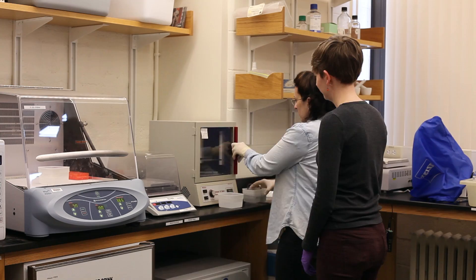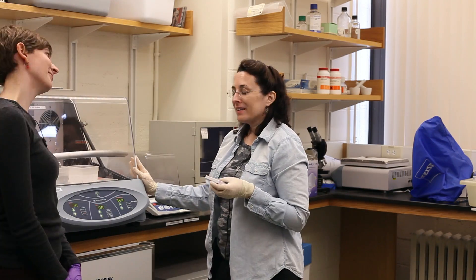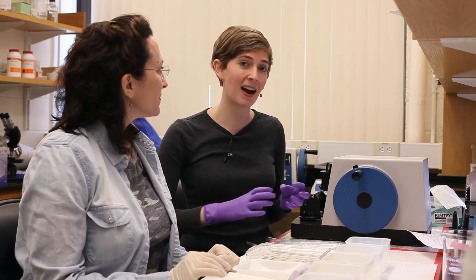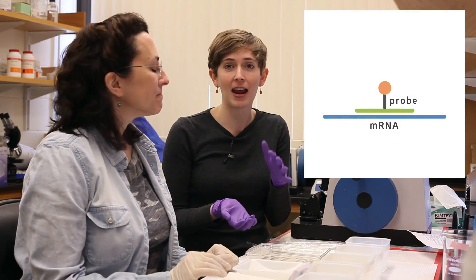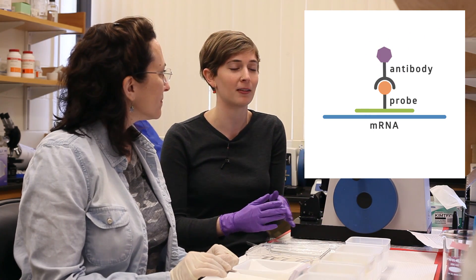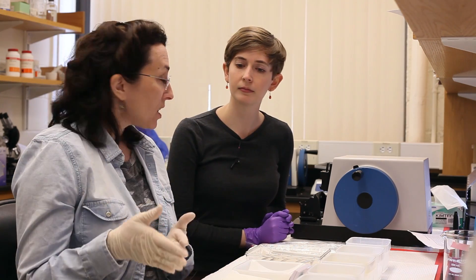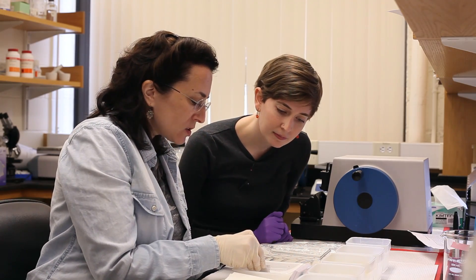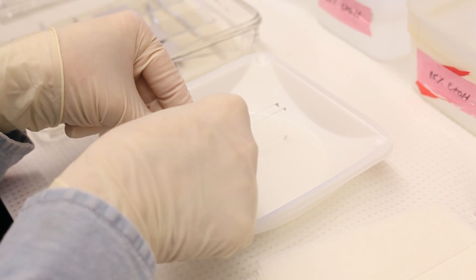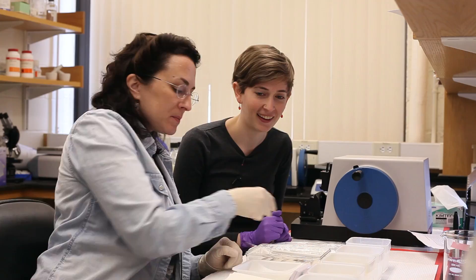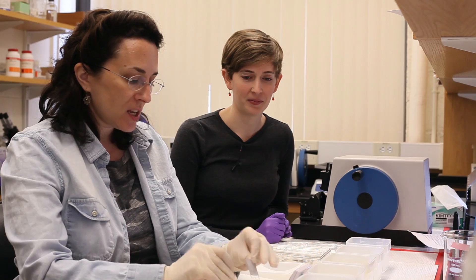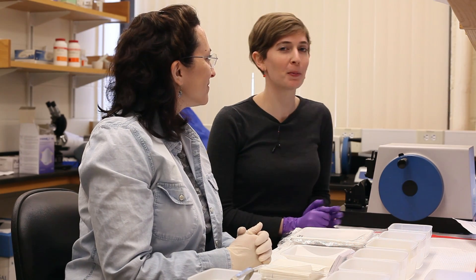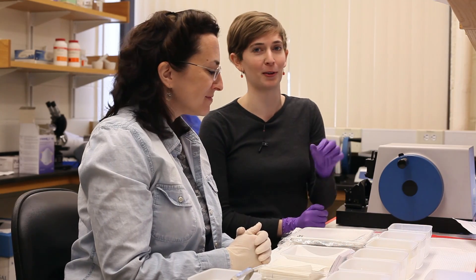Now it's ready. We wash away any extra probe that didn't hybridize so we're not getting any false signal of gene expression. Now it's finally time to visualize where the probe has hybridized to histone H4. We add an antibody to the slide that will interact with the probe, which reveals where the gene is being expressed — just like we used antibodies in Episode 4 of Season 1. I'll pick up a pair of slides and put them into the solution that has the antibody, sandwiching them together so the solution gets drawn up between them. We let them sit for a couple hours to let the antibody attach to the probe. After that, there are more solution changes — but we're going to jump ahead to actually looking at the results.